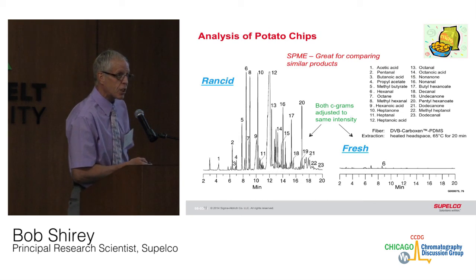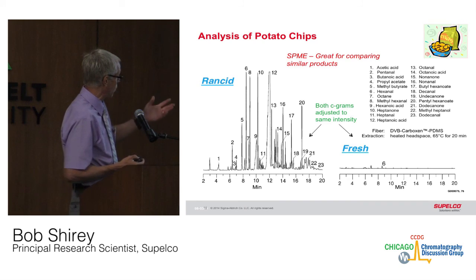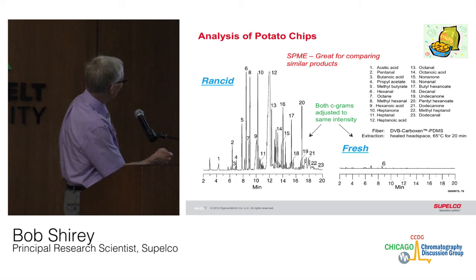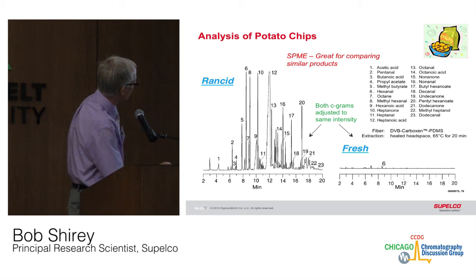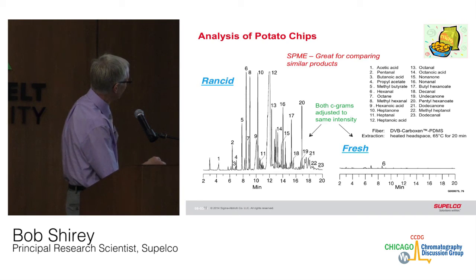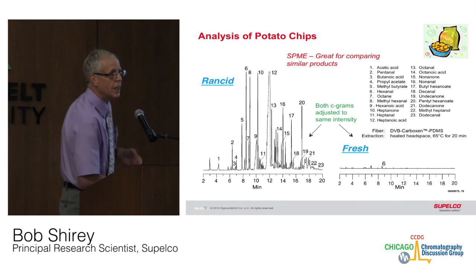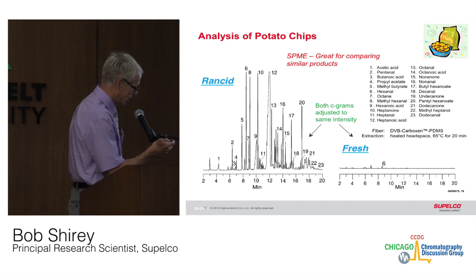This is an extreme case of this. Somebody left a bag of chips in the lab that they bought for analysis. They left the company. I found them 2 years later. You can see the high degree of rancidity. Not only did a lot of hexanal form, it was further oxidized into hexanoic acid. You see that with heptanoic acid also. Extremely large peak. You compare that to a fresh bag of chips, but even then you're starting to see a little bit of hexanal. It's almost impossible not to get some cleavage of these double bonds.